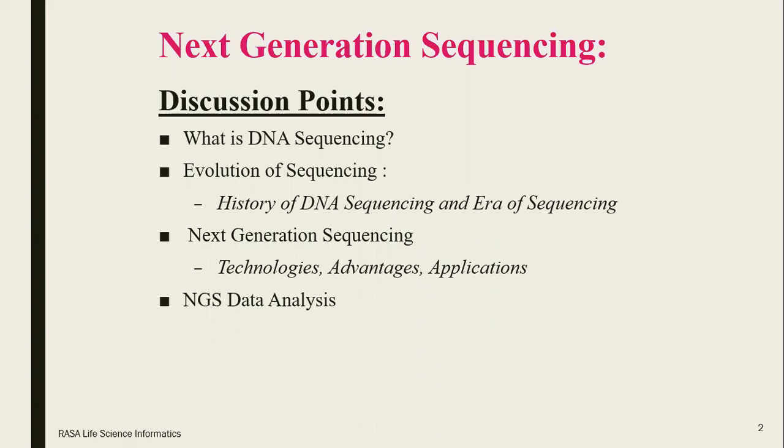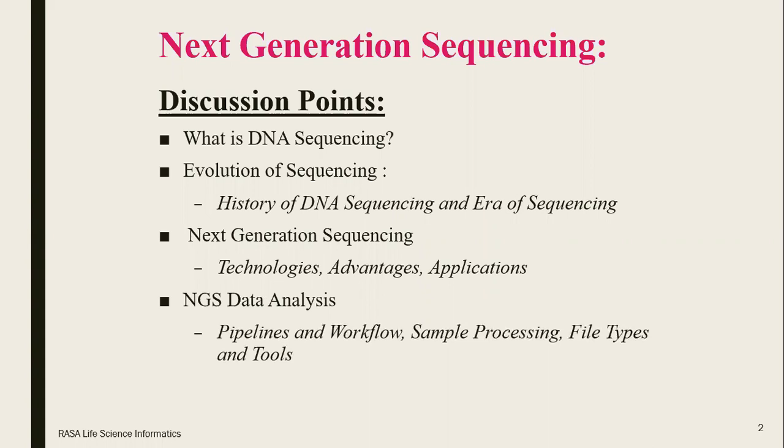We will also be discussing some aspects of NGS data analysis, which will include points like the general pipeline and different workflows, sample processing, file types and tools used. And lastly, we will be summarizing the session. We will discuss the future perspective.